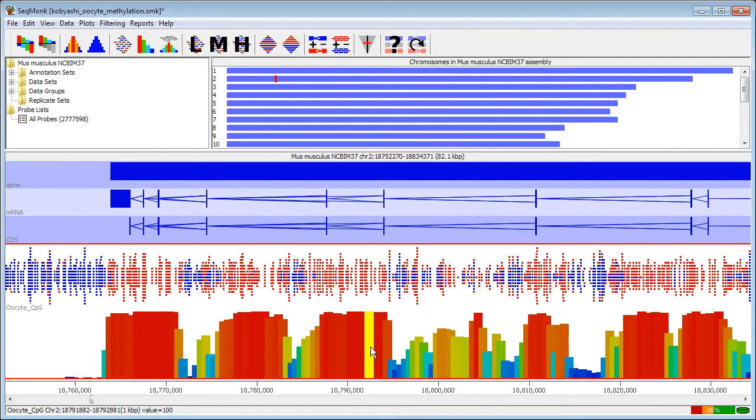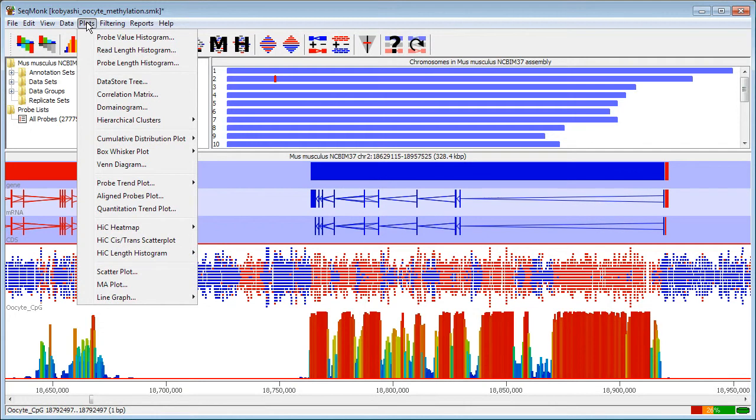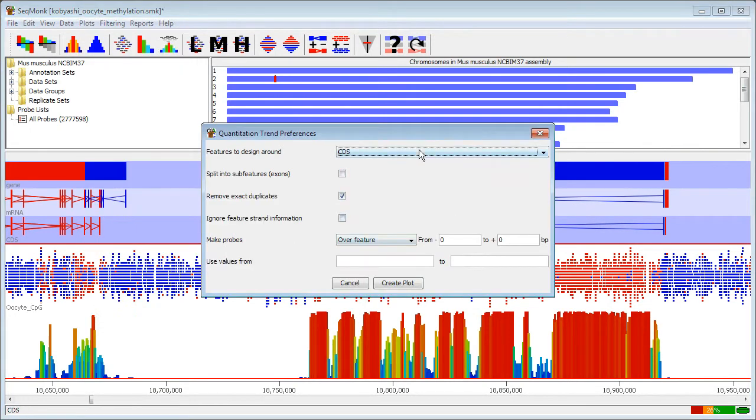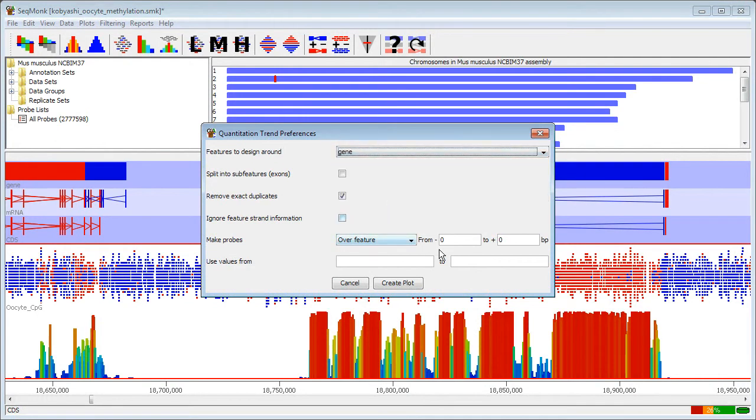To summarize these then across all genes what I can do is to go to Plots and Quantitation Trend Plot. I'll select that I'm going to quantitate over genes with 5 kilobases of context, upstream and downstream.